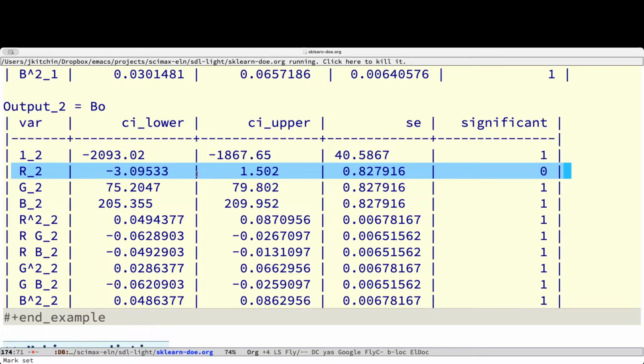Now, in other design of experiment packages I've seen, they would calculate p-values and do f-tests and tell you if it's significant based on p being less than, say, 0.05.